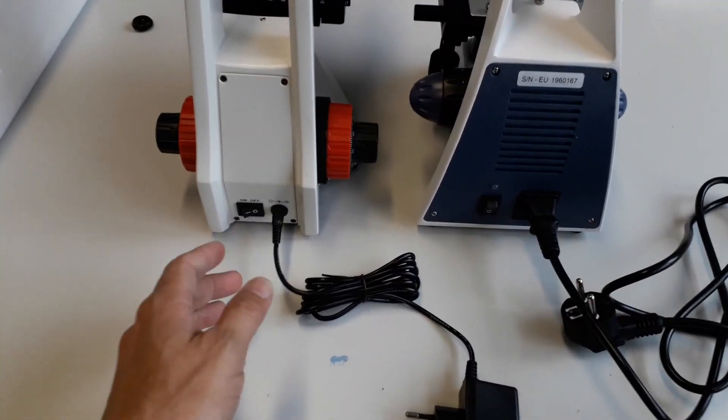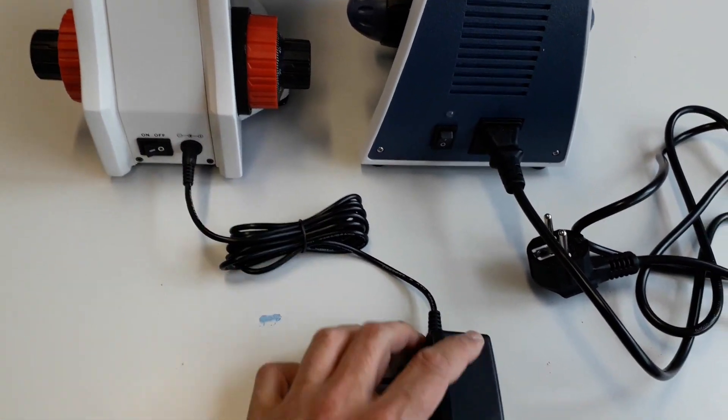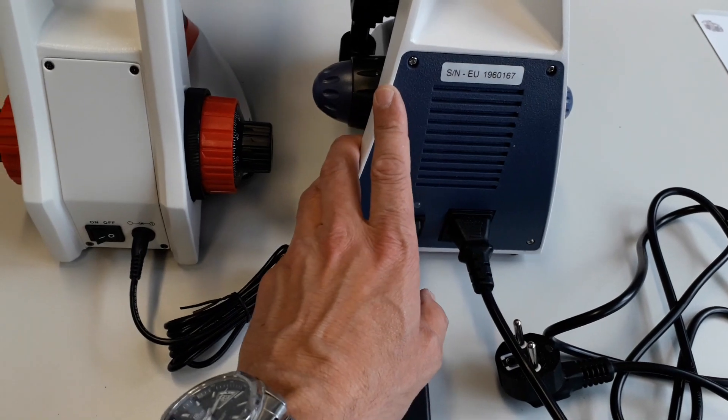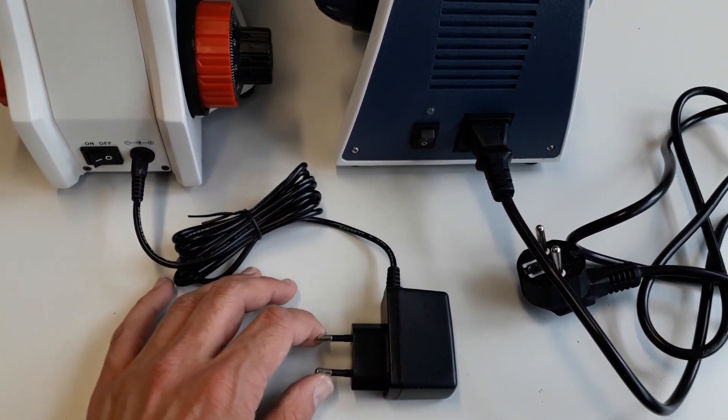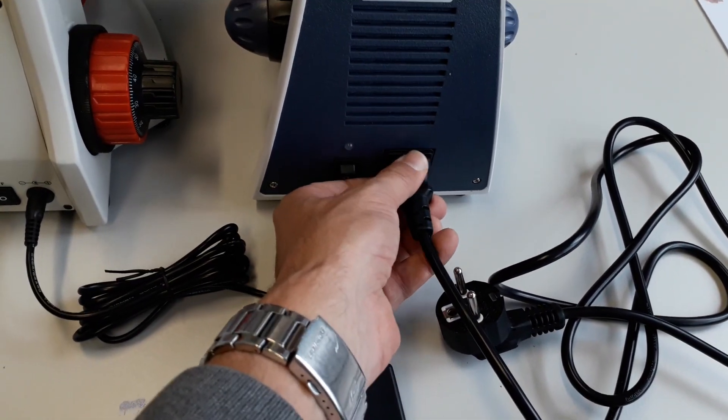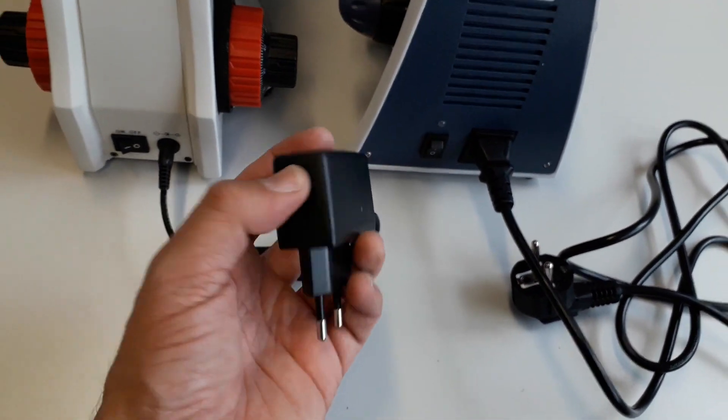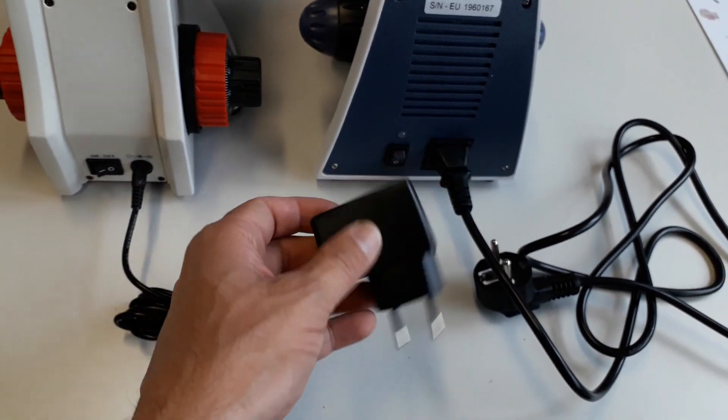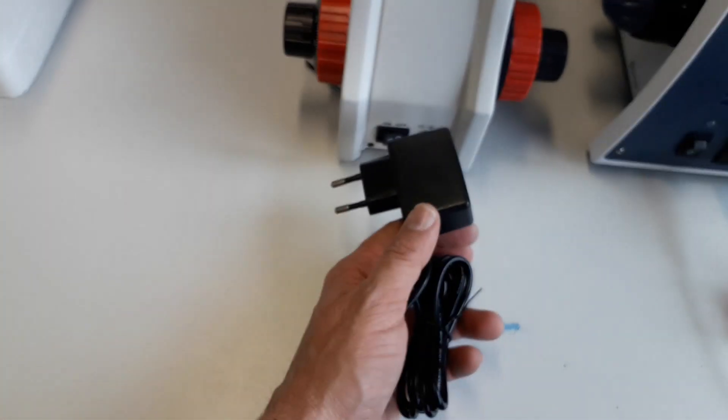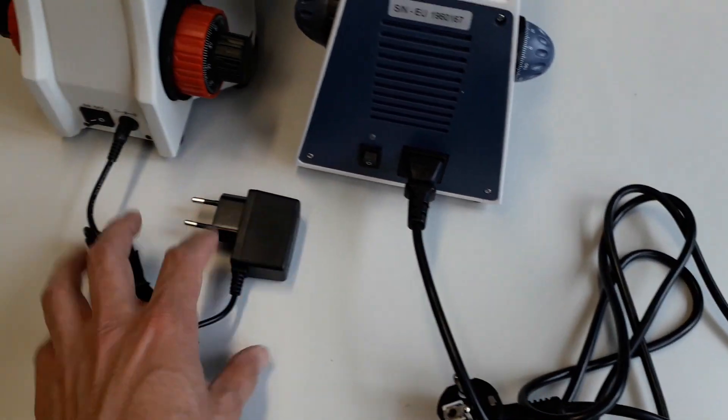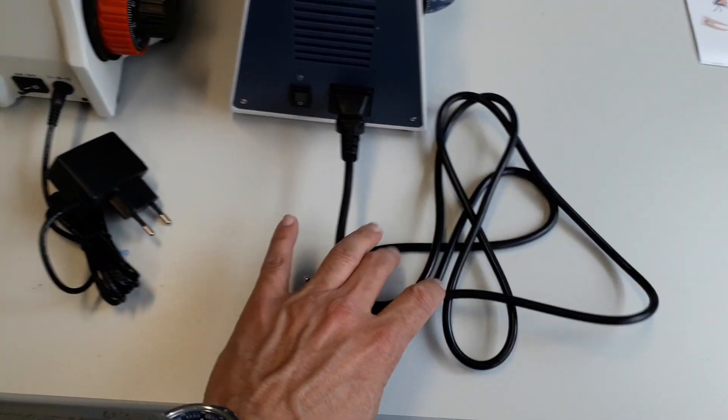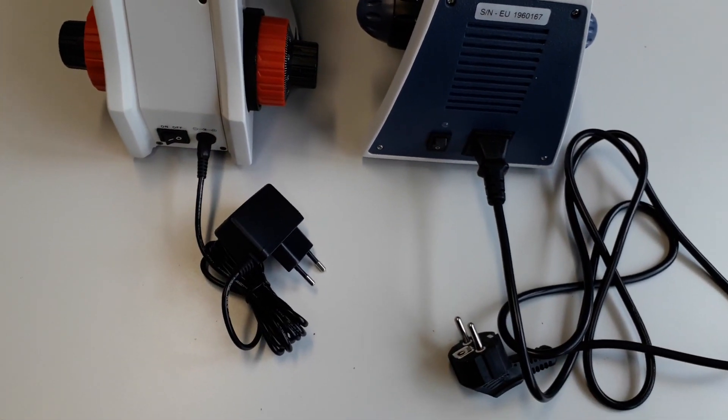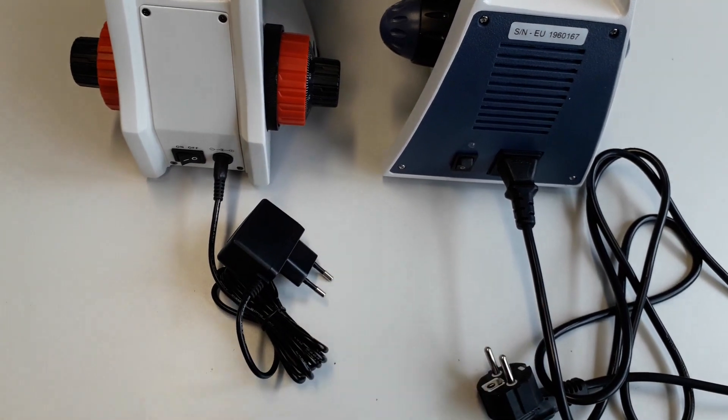So basically, what are the differences now? The differences are that in one case, you've got the power supply on the outside, in the other case, you've got it on the inside. I thought that initially that we should buy microscopes that have an internal power supply. But then actually, I'm right now seeing it's not so big anyway. As a matter of fact, the total mass of the cable here is actually lower than this one over here. It might also be easier to wrap this cable around the microscope than this one over here. I think that's really a question of taste. So that probably should not be a major main criterion.